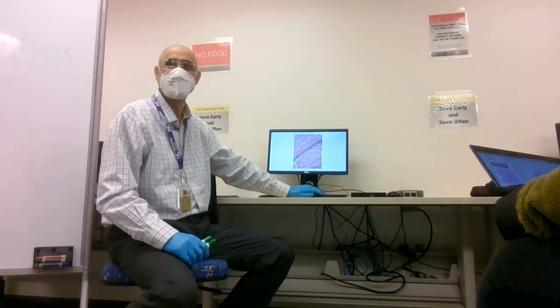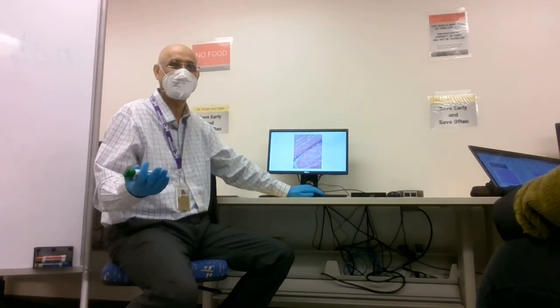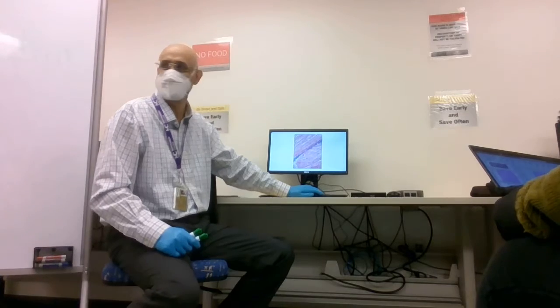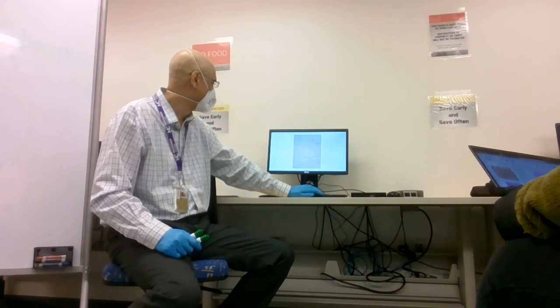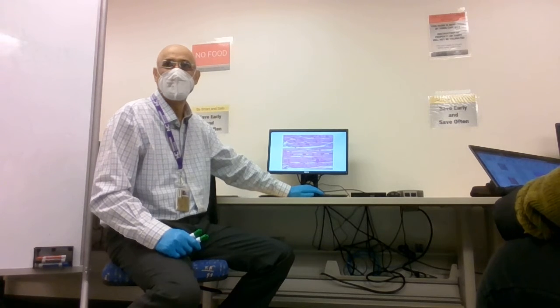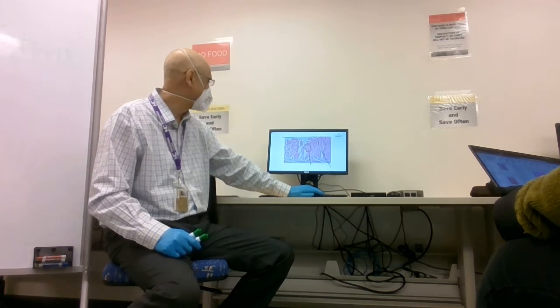This is smooth, alright, guys? Why is it called smooth? Because it does not have striations. Since it does not have striations, it's called smooth muscle. Skeletal. This is smooth. What is this? Cardiac. Good job, guys.